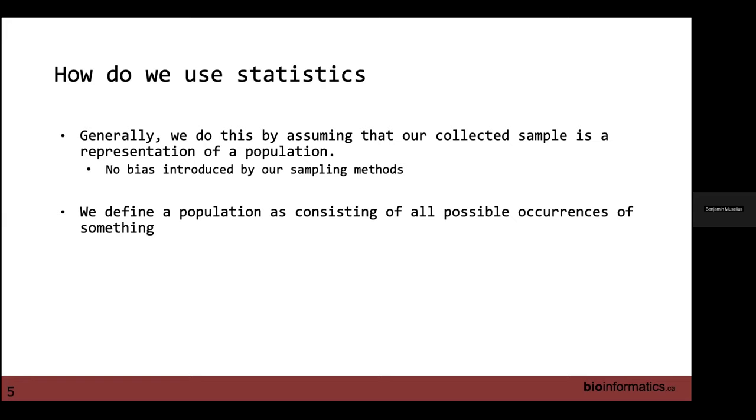So often in statistics, we'll talk about a population. We define a population as all possible occurrences of something happening.